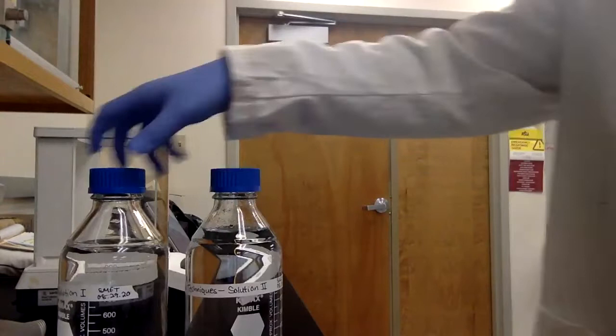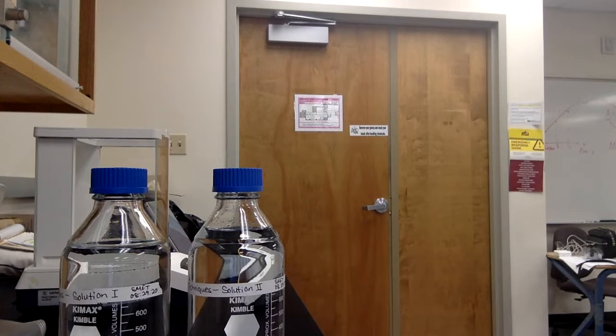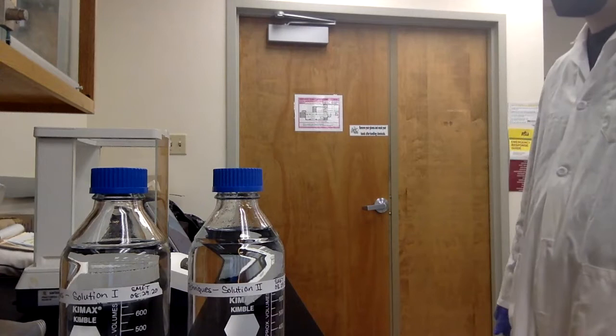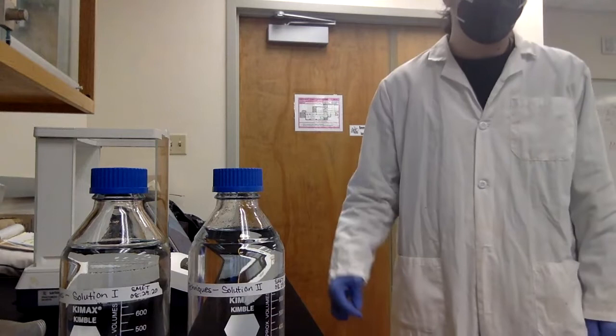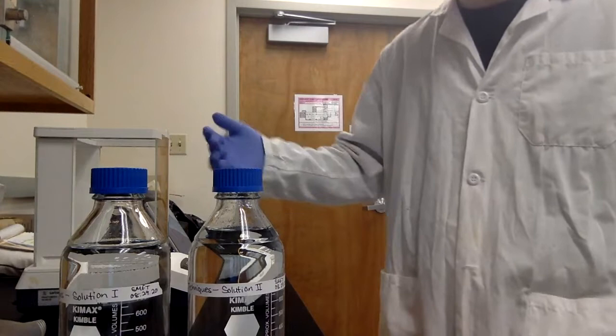And this is the balance we are going to use. Basically, you grab an empty tube and you measure the mass of the tube first. Then you zero it. You don't have to remember the mass of the empty tube. You just put the empty tube on the balance, and then you zero it, and you add your liquid in it, you measure it again, and it will give you the mass of the liquid.